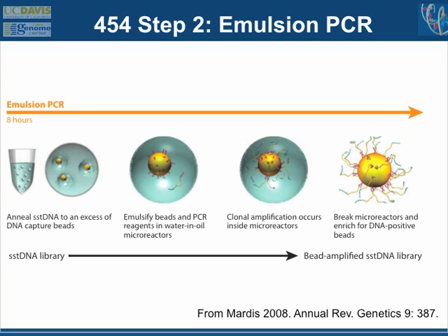So a huge challenge in all of the emulsion PCR-based methods is to try and get 1 piece of DNA in each of the emulsion beads and detect that and not run sequencing reactions afterwards that either read 2 DNA sequences at a time, which you can't interpret, or have no DNA in them.